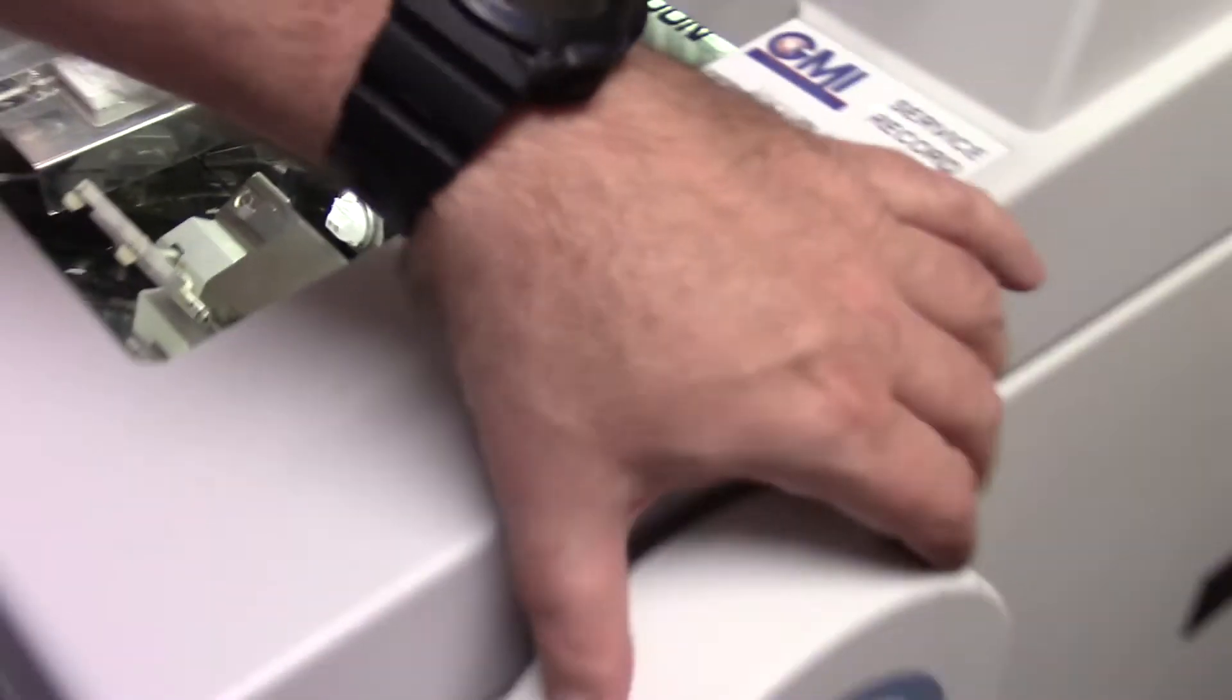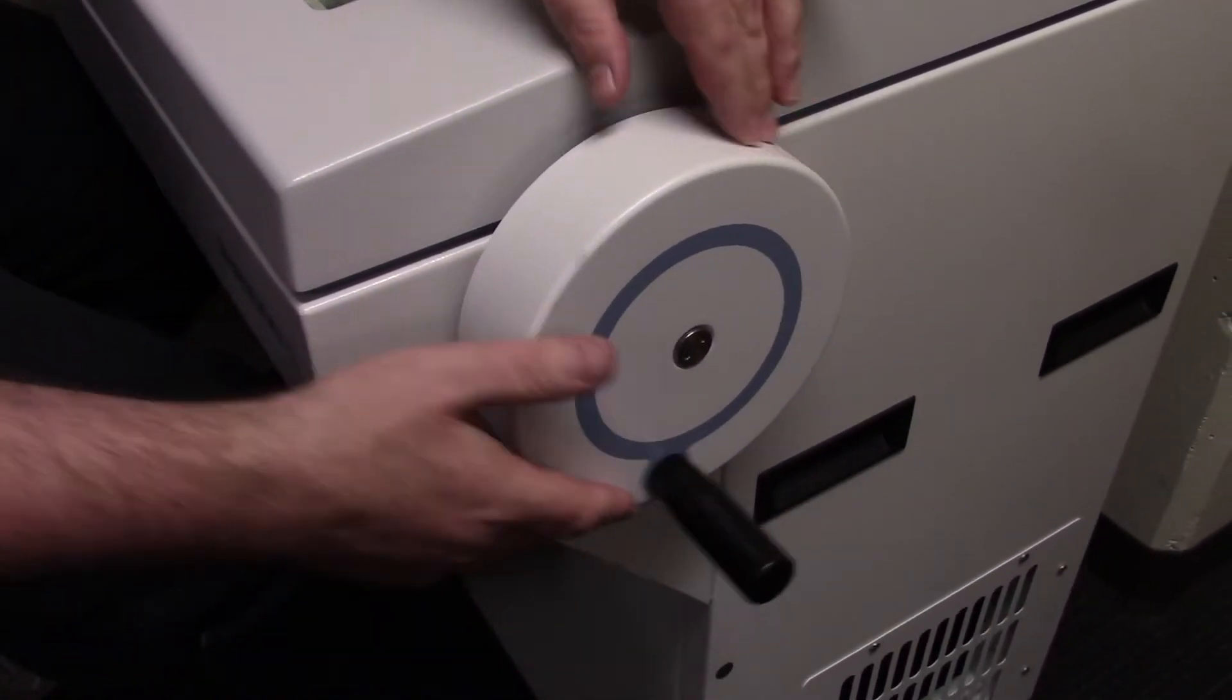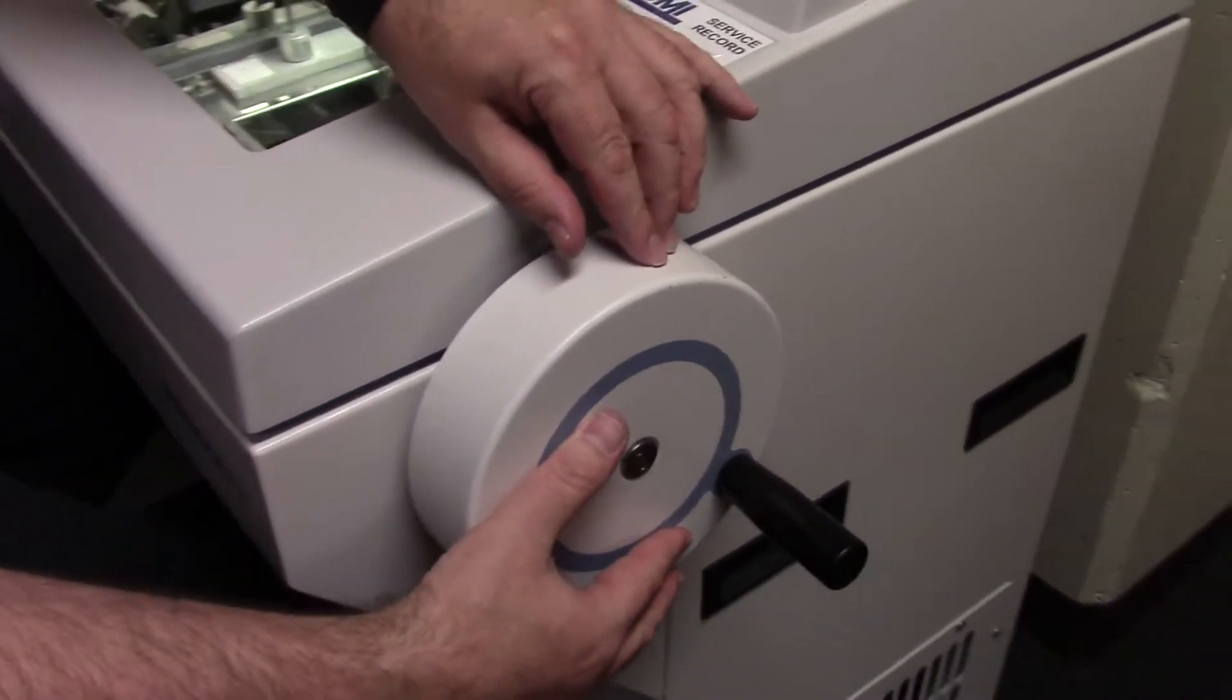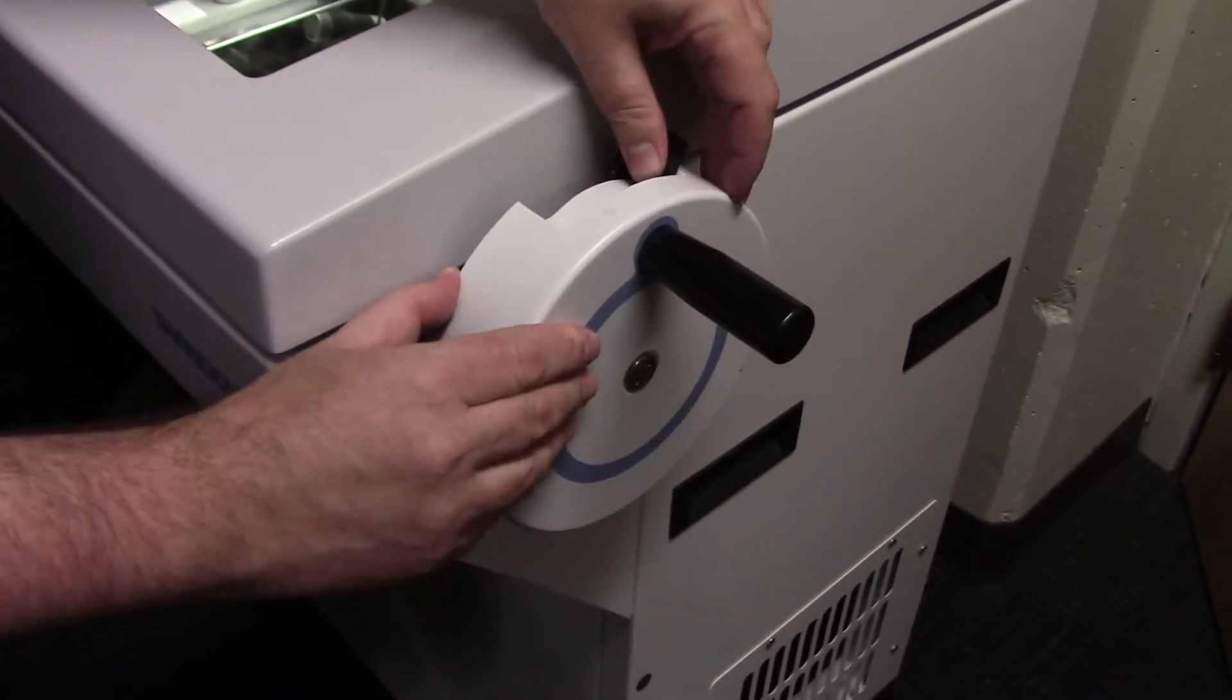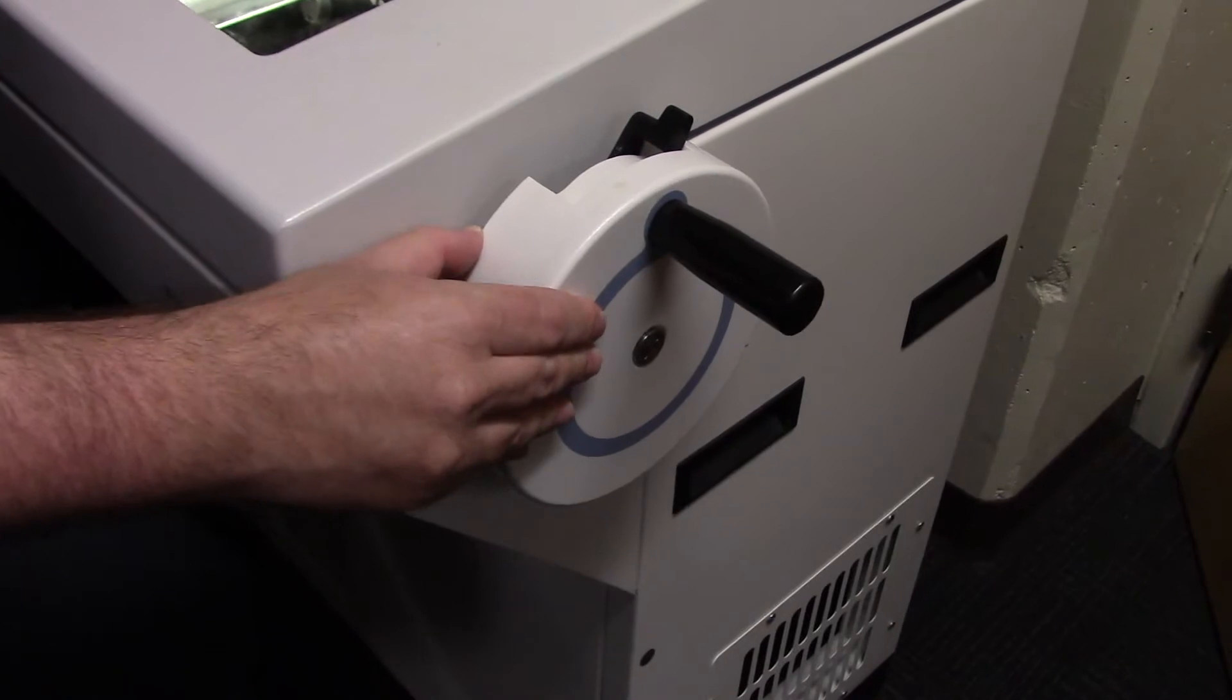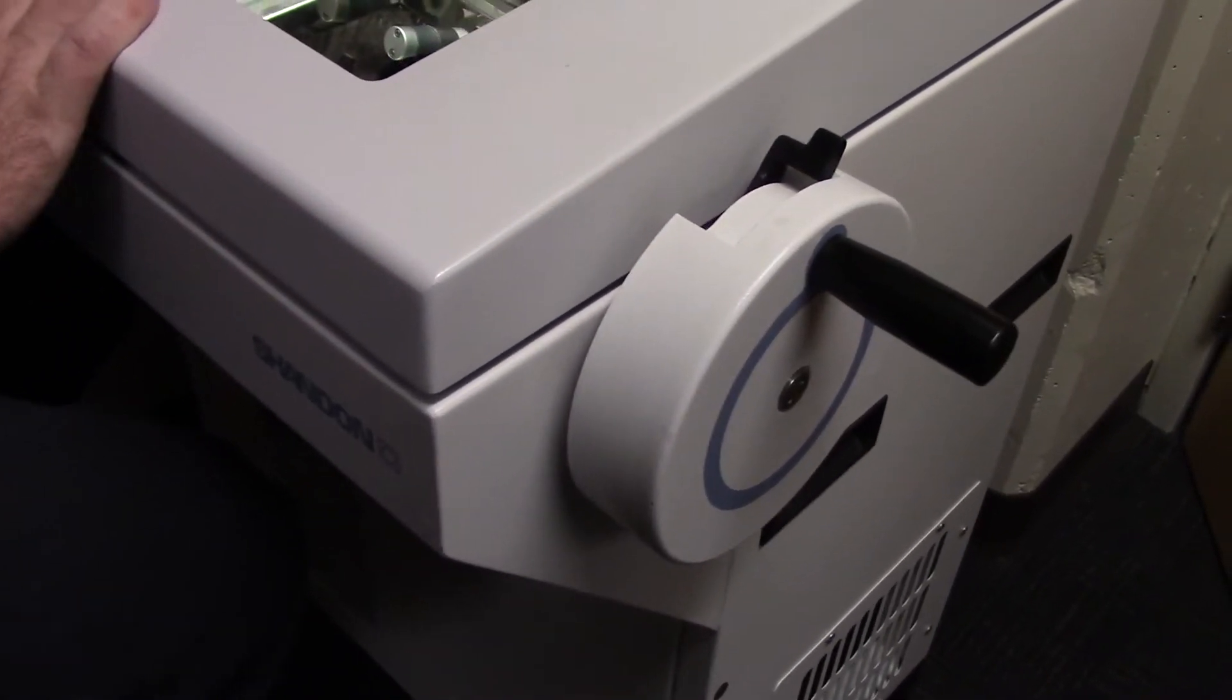First of all, what I'm going to do, if you can look at the wheel over here, if I put the wheel with the handle towards the top, this is a locking mechanism. Now I cannot move the chuck.